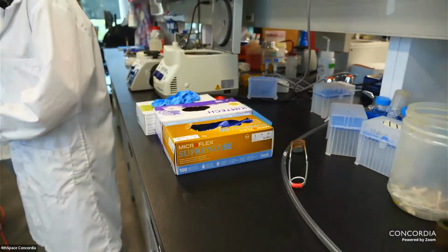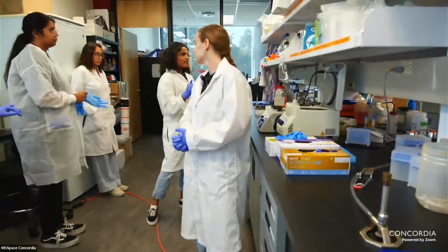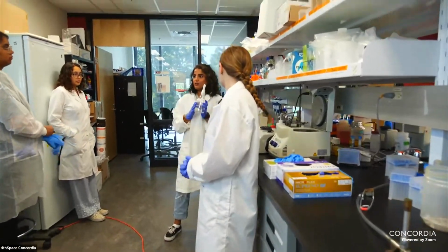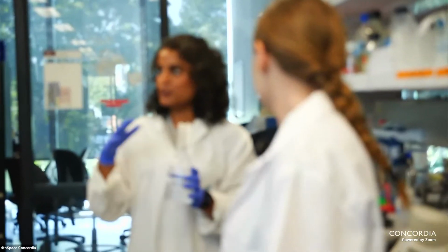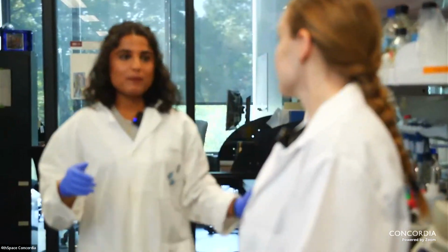Before we start any work on the working stations, we always sterilize them with 70% ethanol, which we've already done, and we'll do it again after the work is done. It's good lab practice to remember. Now Sydney will give a demonstration. I'll show you guys over here.